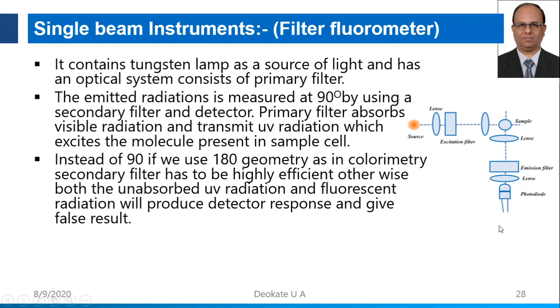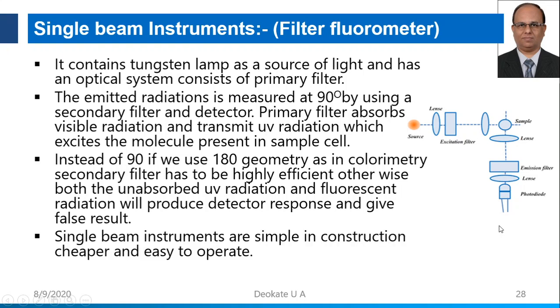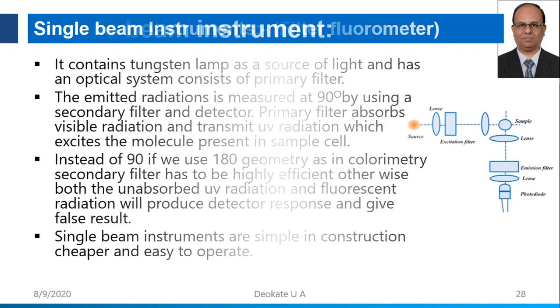It is always to be kept at 90 degrees. So this is always asked. The single beam instruments are simple in construction, cheaper and easy to operate.